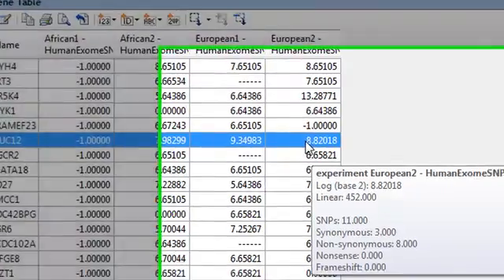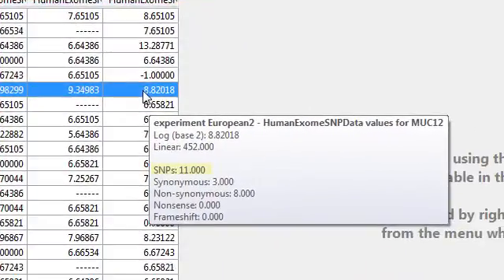such as this one, which shows me that there were 11 SNPs occurring in this gene for this individual, and 8 of them were non-synonymous.